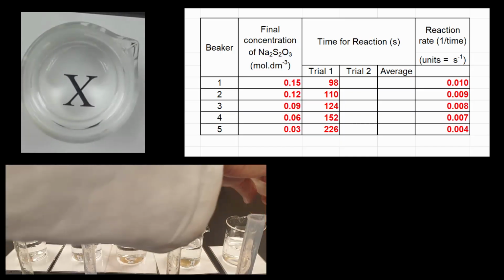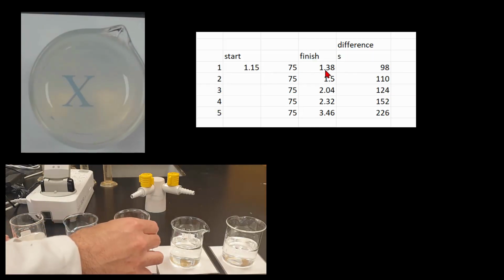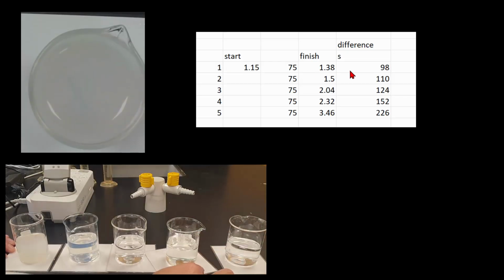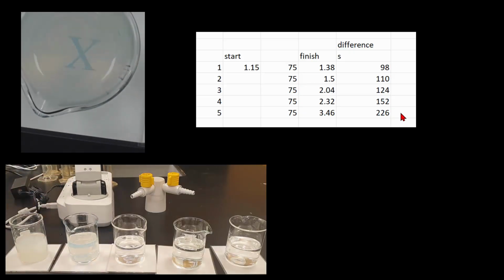Now I've just taken times off the video to see how long it takes. So I started about 1:15 on the video. It stops at about 1:38. And so that's 75 seconds to whatever seconds the difference is here. And so that's how long each of these ones took.